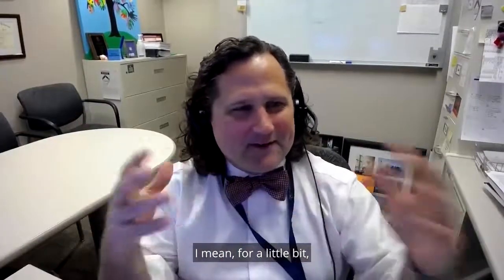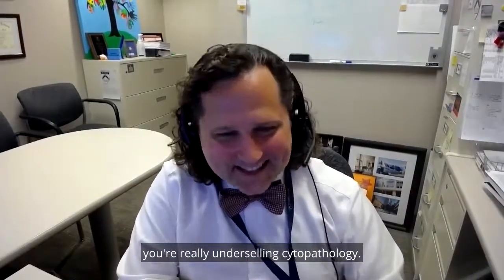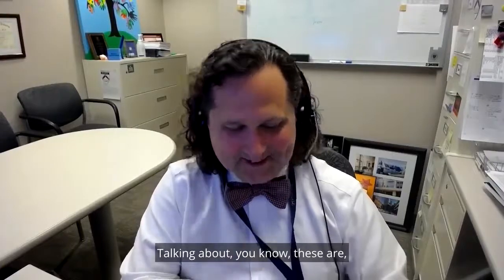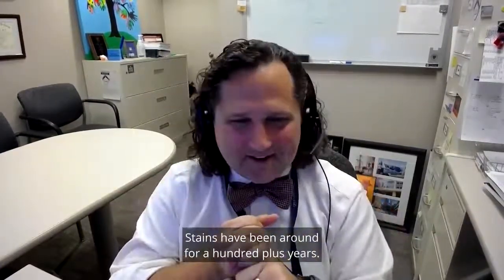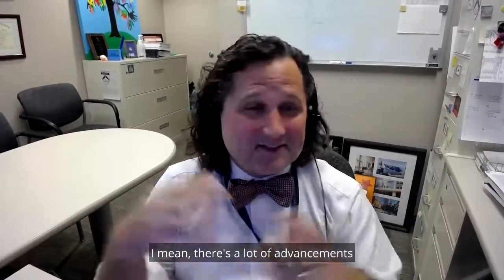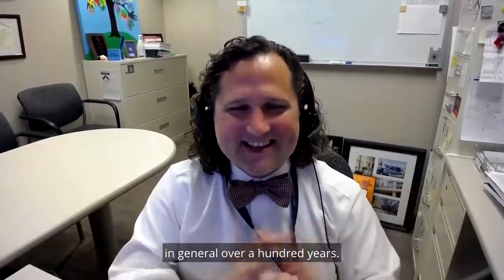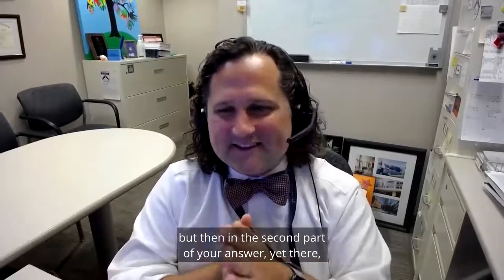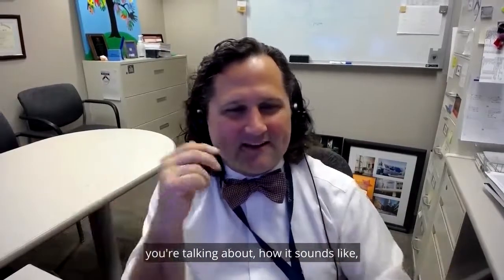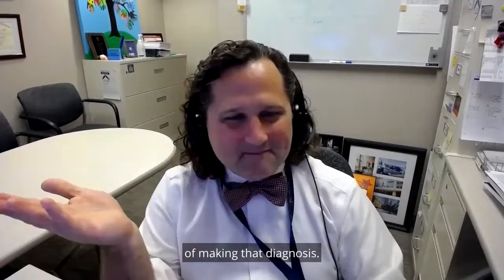For a little bit when you were starting out your answer, I was like, man, Dr. Hartley, you're really underselling cytopathology, talking about how you guys are just using two stains and your eyes. Stains have been around for 100-plus years. There are a lot of advancements that have happened in medicine over 100 years, and you guys are still at the core. But then in the second part of your answer, it sounds like as a cytopathologist, you get that mic drop moment of making the diagnosis.